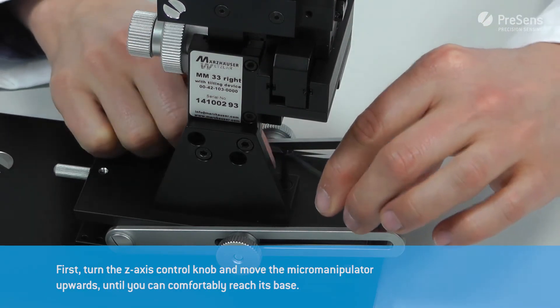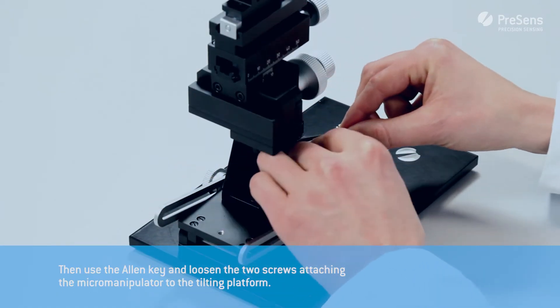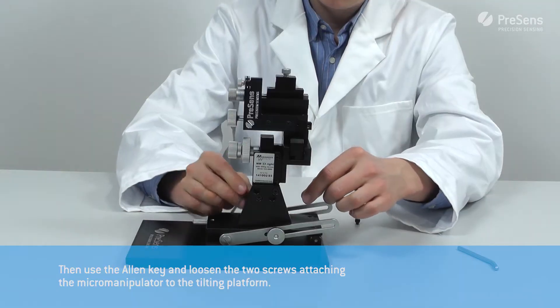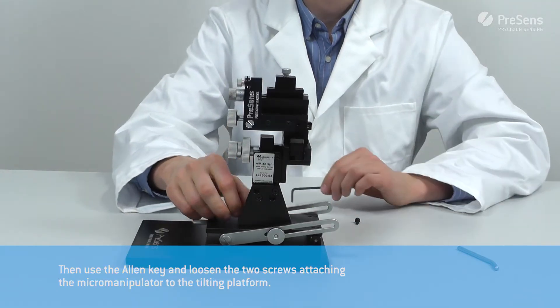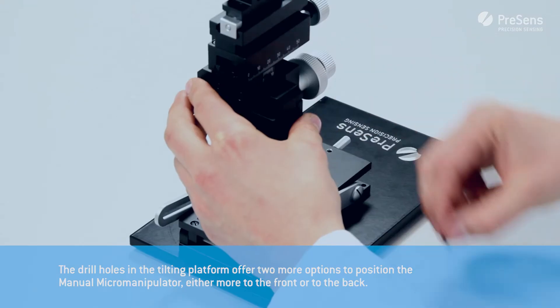First turn the z-axis control knob and move the micromanipulator upwards until you can comfortably reach its base. Then use the Allen key and loosen the two screws attaching the micromanipulator to the tilting platform.